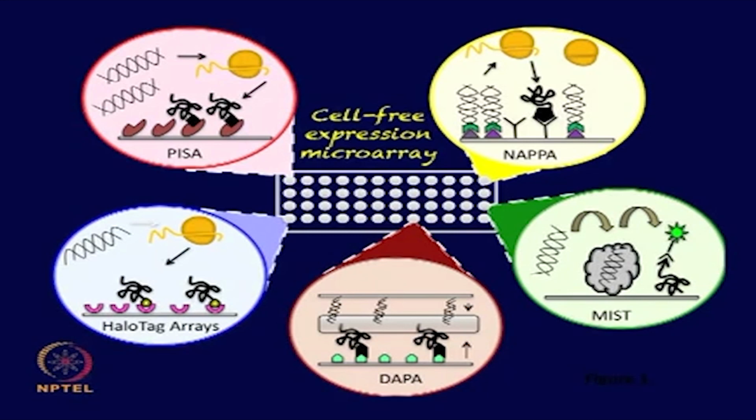The application of cell-free expression based protein microarrays has seen a rampant increase because of the ease of synthesizing the proteins using a cell-free expression based system, as compared to the traditional cell based way of purifying the protein and then printing on the array surface.